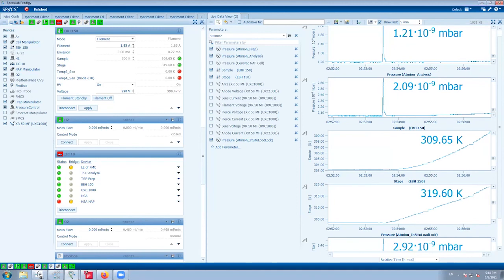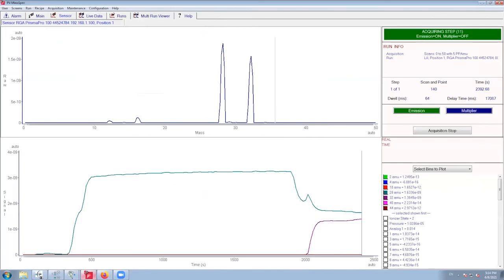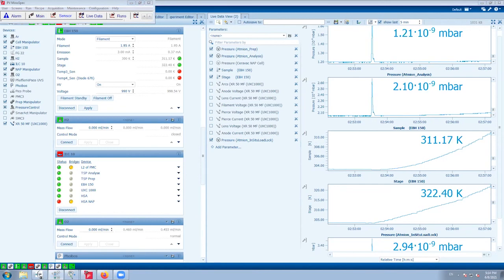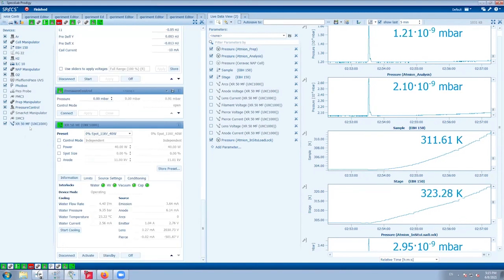Actually, the idea is to measure spectra as we showed, and then of course to process them. Processing is, as Brett said, using software like PolyXPD or CASA, just to find some peaks which are hidden inside this measured spectrum, and then to assign these peaks to different species which you have on the surface or in the bulk material.